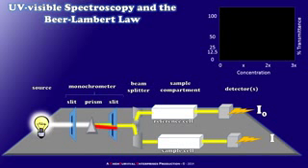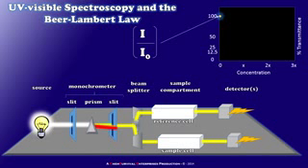So in this case, the intensity detected by each of my two detectors is the same. If I were to consider the ratio of the intensity leaving the sample cell to that leaving the reference cell, I see that the transmittance of my sample cell is 100% that of the reference. So I'm going to plot that here at 0 concentration, 100% transmittance.